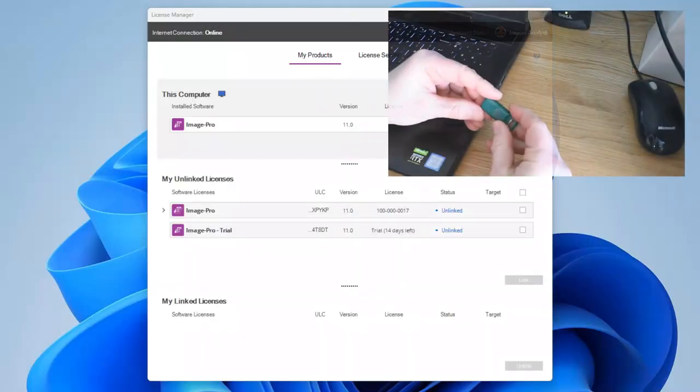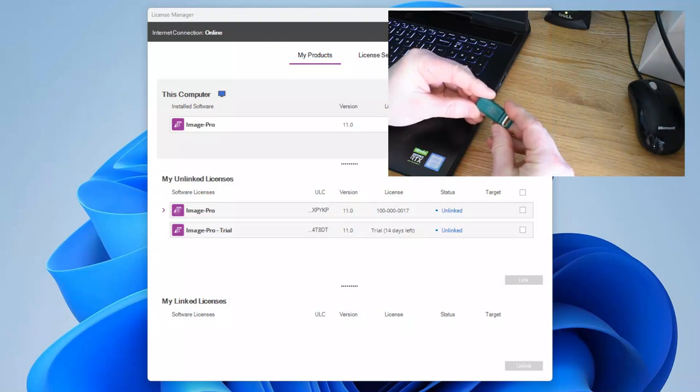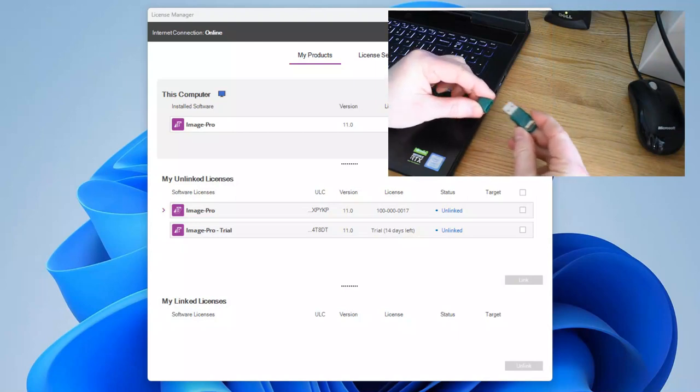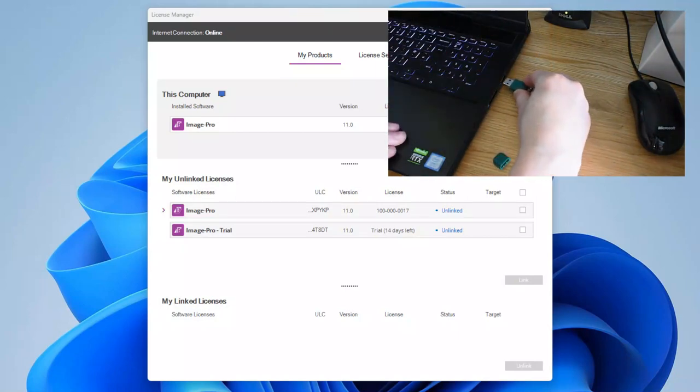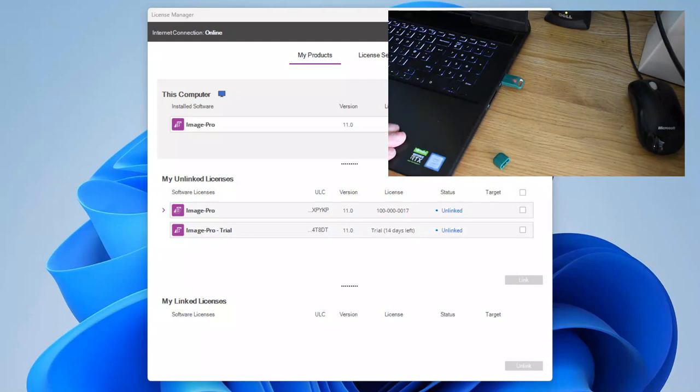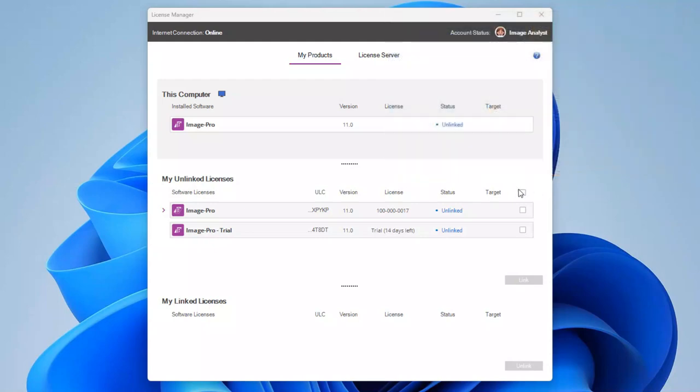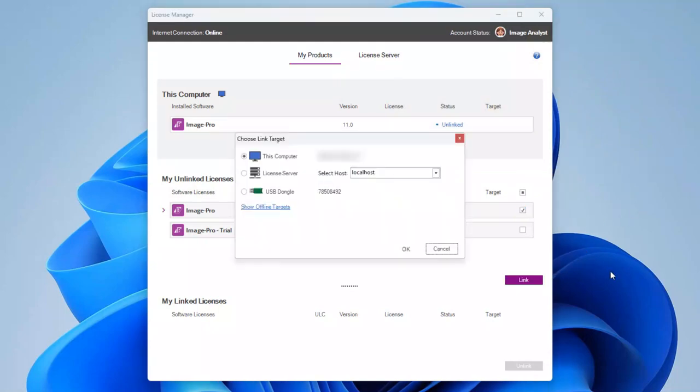Next, we'll link a license bundle to a dongle. At this point, you must plug in your green MaxSteel dongle into a free USB port on your computer. Select your license bundle in the My Unlinked Licenses table and click Link. Select the USB dongle option and click OK.